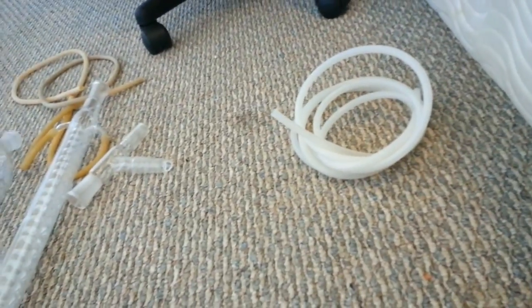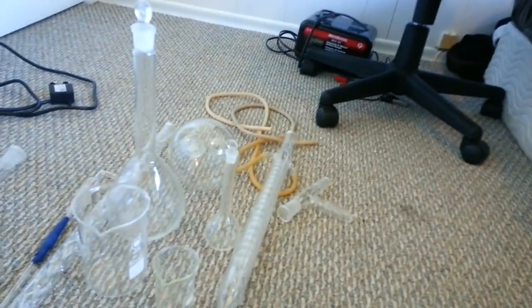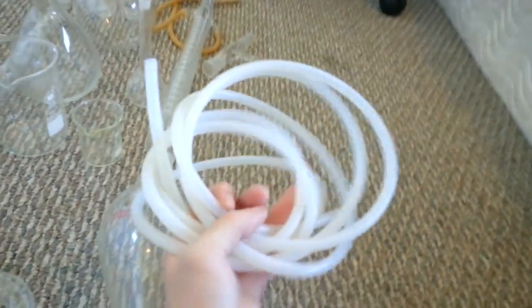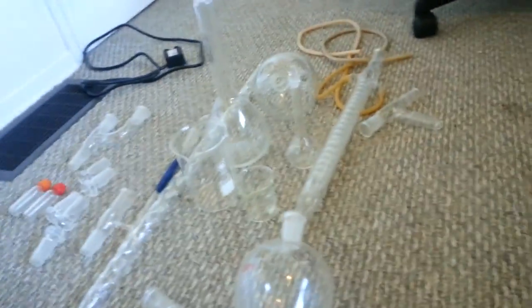Get some tubing. If you're dealing with gases or anything like that, it's good to have. This is silicon tubing. You can also use rubber tubing, or teflon tubing is super good because it doesn't react with hardly anything — unfortunately, I don't have any of that.